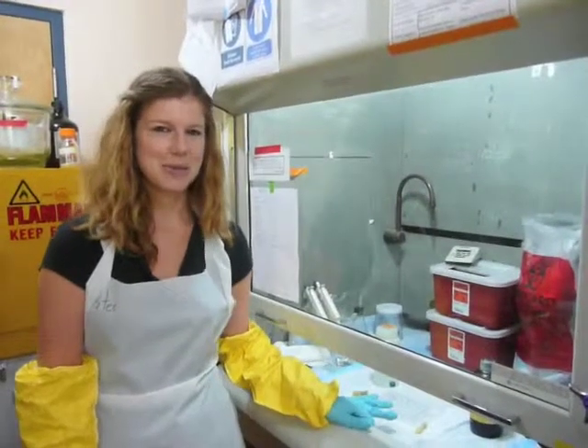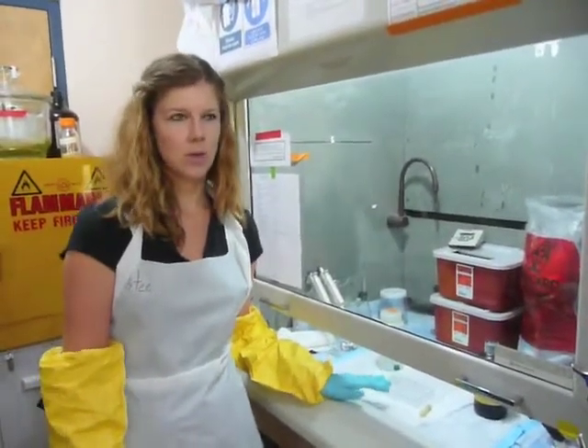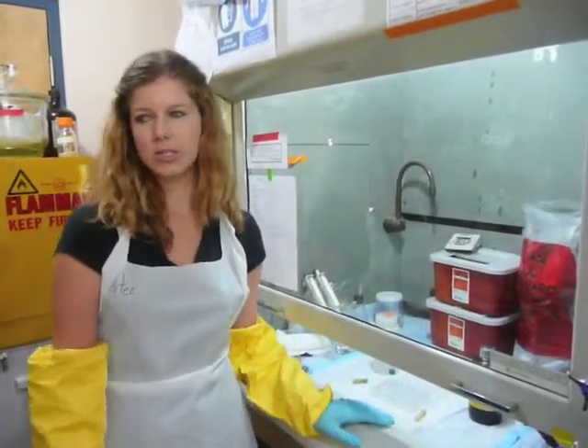After fixing in osmium for about three hours, we do three to four washes with distilled water to get rid of all the osmium, and then we can move on to drying.